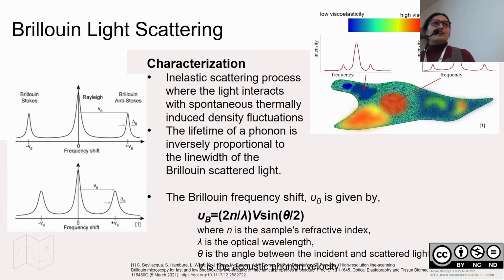Just to give you an idea of the difference between elastically scattered light and inelastically scattered light. Elastically scattered light can be Rayleigh or Mie. And if I have to compare it, elastically scattered light would be the Eiffel Tower, and inelastically scattered light, that is Brillouin scattered light, would be an ant. So if I have to try and get the information from any tissue for Brillouin scattering, I need something known as a spectrometer, and I will be explaining that later.